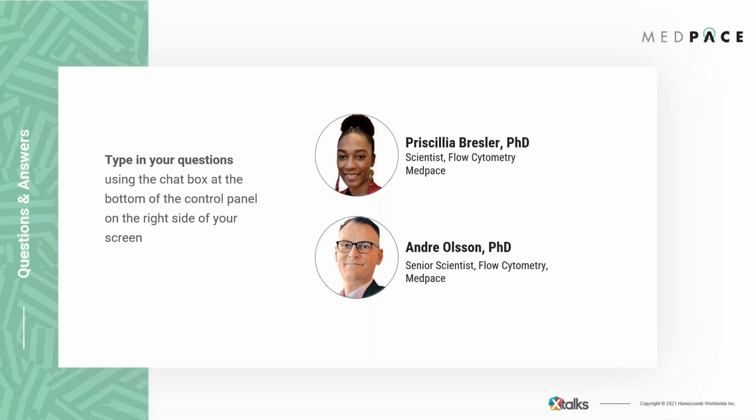Great, thank you so much, Andre. Our next question is, how long does it take to develop RO assays, ranging from conception to validation? Maybe I can comment on that. I can reply for Medpace. Here at Medpace, when we develop an assay from scratch, including the optimization, that can take 14 to 16 weeks.